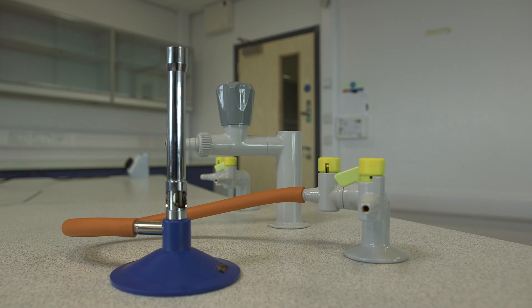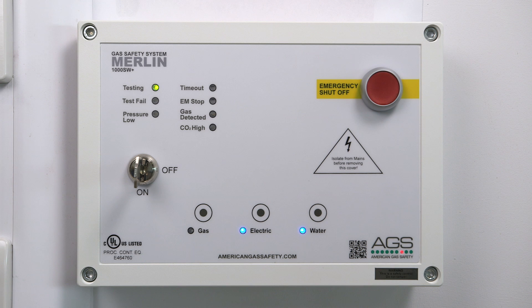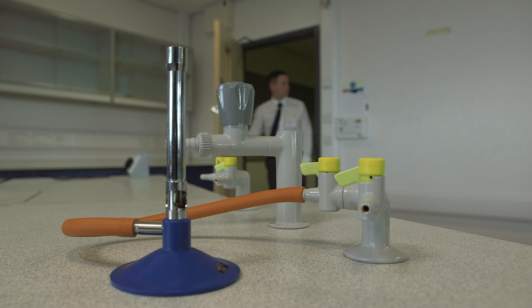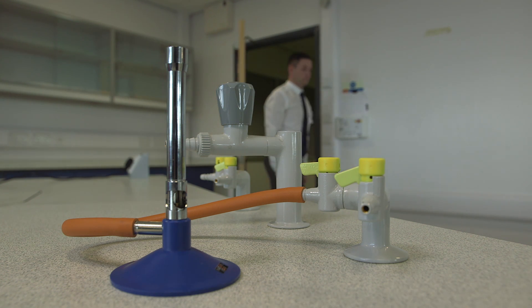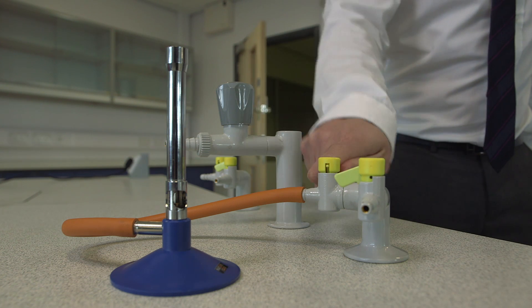Each Merlin panel can accept the input from up to three AGS gas detectors. Available detectors include natural gas, LPG, or carbon monoxide. Upon detection of a gas leak, the panel will go into alarm mode, shutting down the gas supply. The Merlin panel will only allow the gas back on once the level of gas in the classroom has dropped below the explosive alarm level.